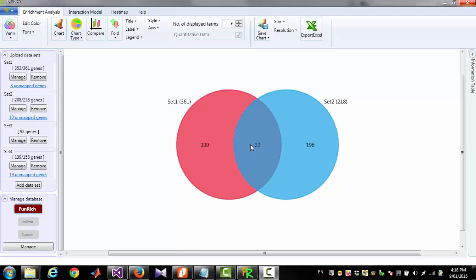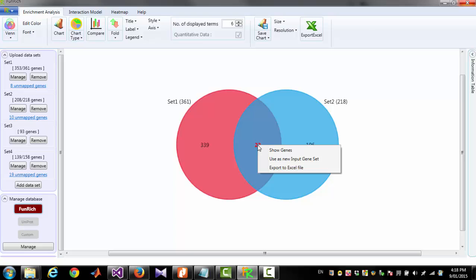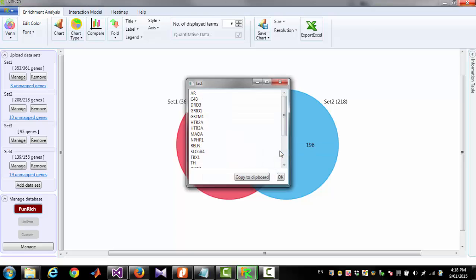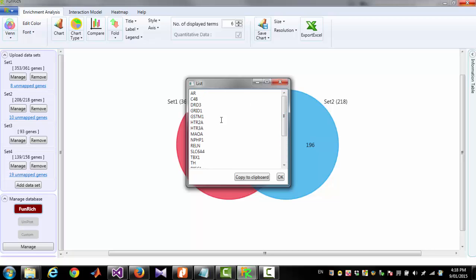In this Venn Diagram 22 genes are common. You can see the list of genes by mouse right click on this number and click Show Genes. This will give you those 22 genes.